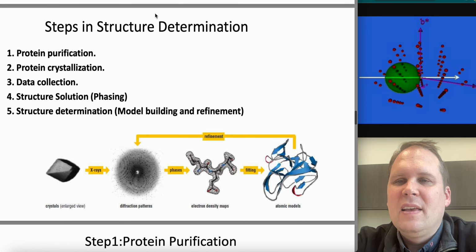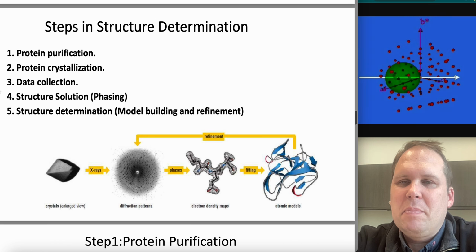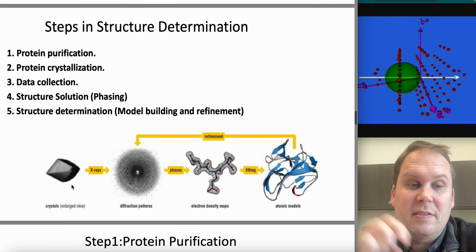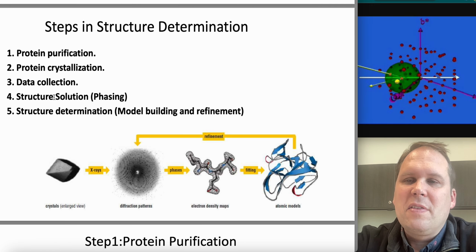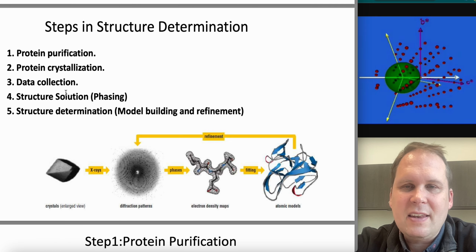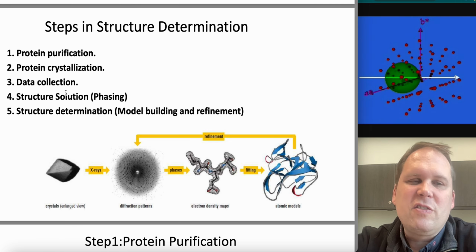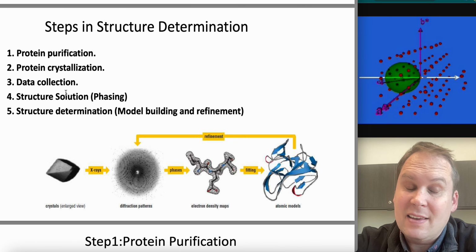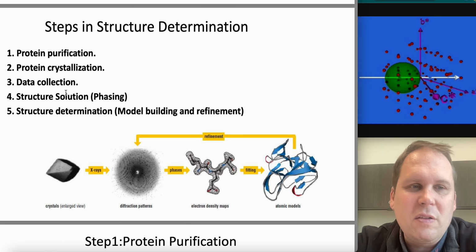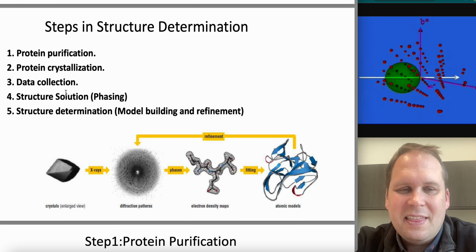Okay. So you purify the protein, you crystallize the protein, which often involves making smaller seed crystals that you then enlarge. You're then going to, usually in modern crystallography, probably have an in-house X-ray source where you can check to see if your crystals diffract. Because a lot of crystals don't diffract, or they turn out to be crystals of the salts and other agents that were in the buffer.